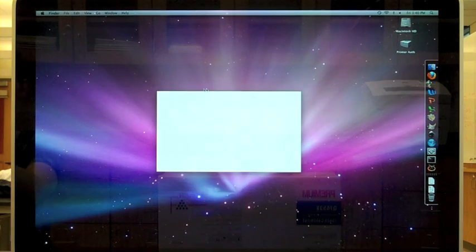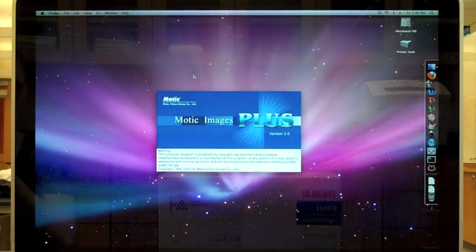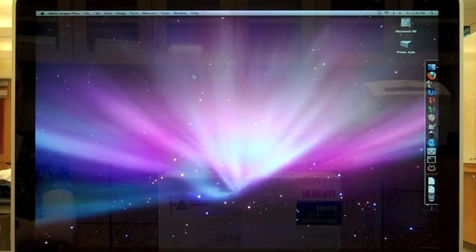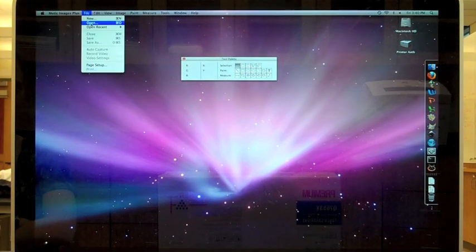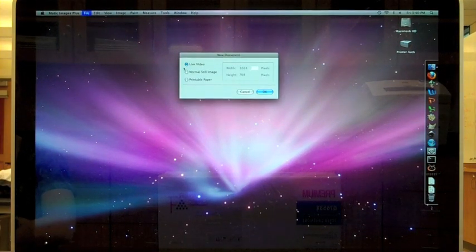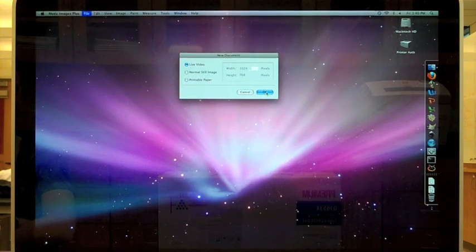Open up the Motic Images software found on the desktop. Make sure the camera is plugged in before you start the software. Click on File, New. A box will open where live video should be pre-selected. Click OK and a new window will open.